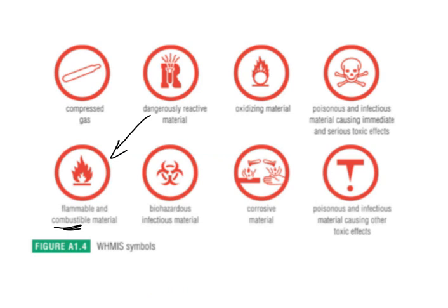Okay. I don't expect you guys to know much about oxidizing yet because we'll only learn about that in grade 12 chemistry. If you want a better explanation, I'll give you one maybe in a small group or one-on-one. But anything that does something called oxidizing has its own category. Okay, oxidizing does not mean that it sets on fire necessarily, though. Okay, I know it looks like this thing is setting on fire. That isn't necessarily what it does. But I'll tell you more later if you care.